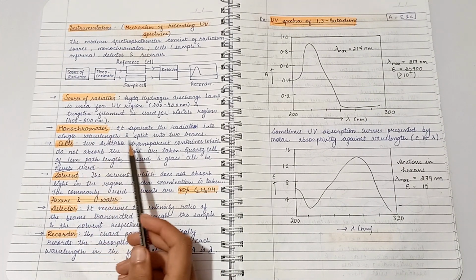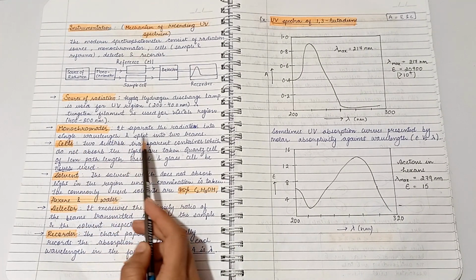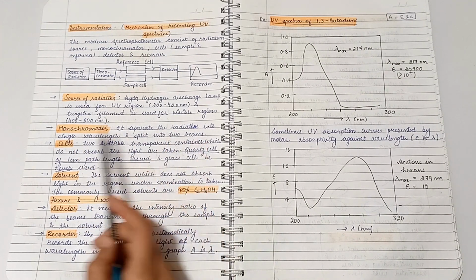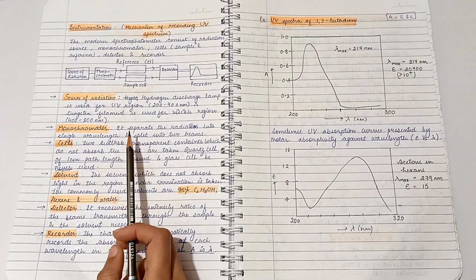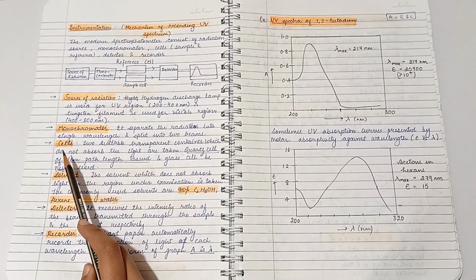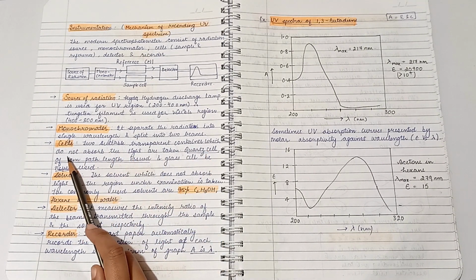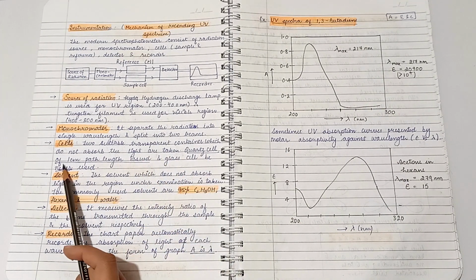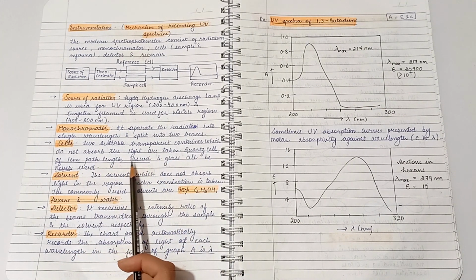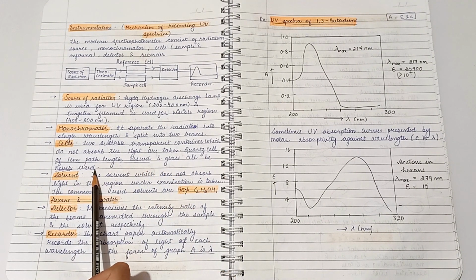Monochromator: it separates the radiation into a single wavelength and splits it into two beams. Mono means single, chromator means light, so it splits the radiation into two beams at the end. Cells: two suitable transparent containers which do not absorb the light are taken. A quartz cell of 1 centimeter path length is used, and a glass cell can never be used. This must be kept in mind.